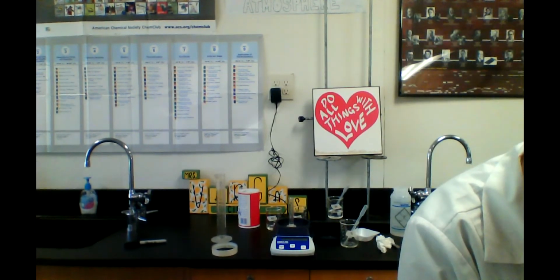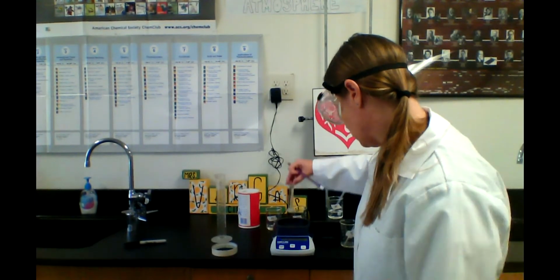10.0 milliliters. Okay, right on the line. So now, because that was 5%, we're going to double the concentration. I can just dump this one out and move straight up to the 10%. I do want to zero it again.